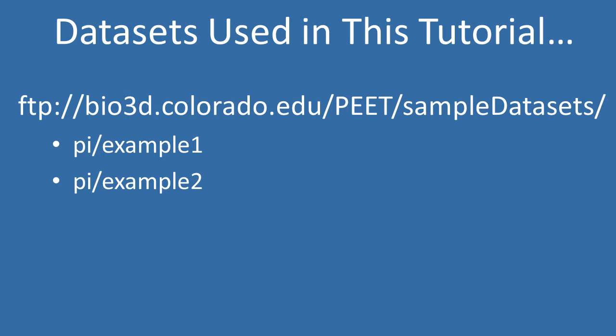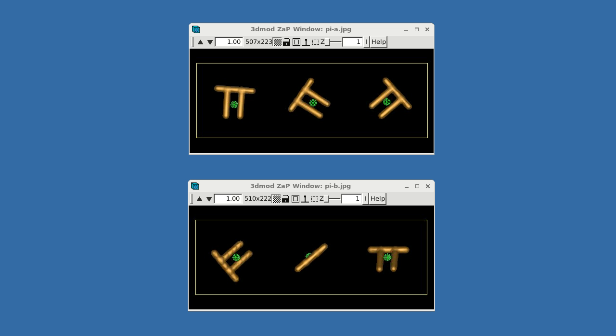We'll use projects example 1 and example 2 in the PI sample dataset. As usual, the sample data and projects can be downloaded from the URL shown on the screen. This dataset is comprised of two volumes, PI-A.REC and PI-B.REC.